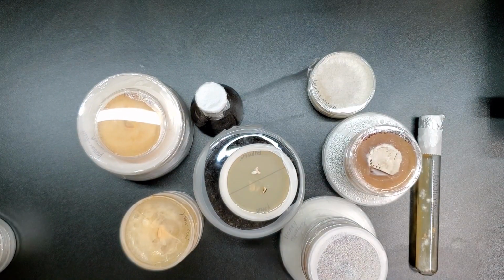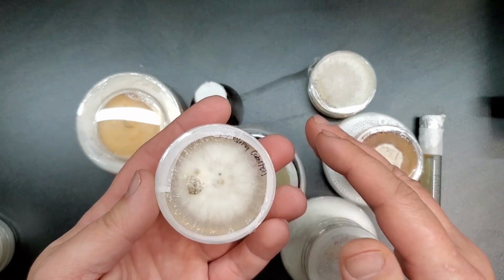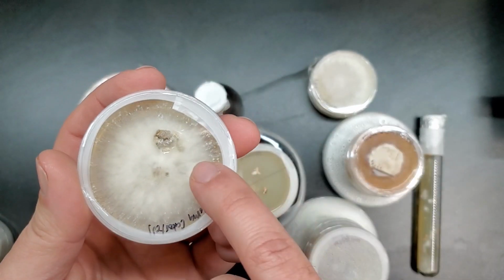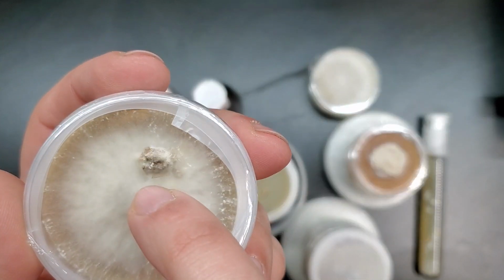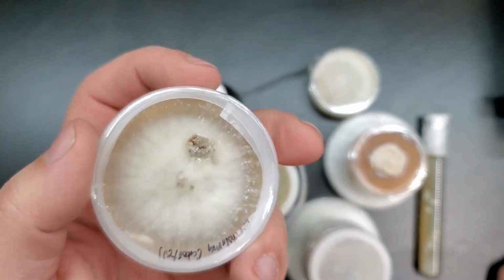But there's something I wanted to show you with these aborted Entoloma, which I think at least are really, really interesting. This is one of the original untouched petri dishes that I inoculated with tissue sample from the mushroom itself. I just left this in my incubator until it fully colonized. And now, look at that right there. The aborted form of the Entoloma abortivum has put off these nodules that look like miniature versions of the Entoloma abortivum, shrimp of the woods.